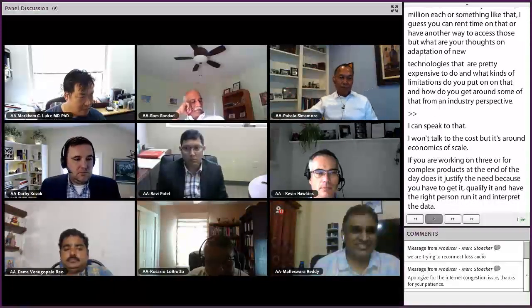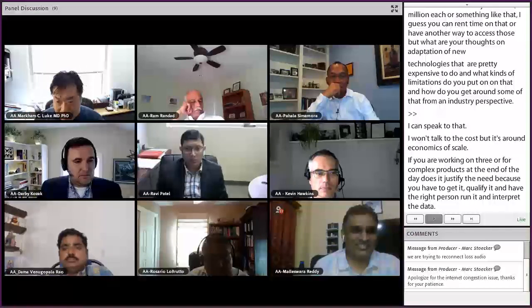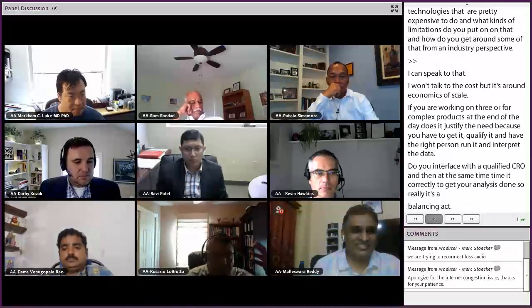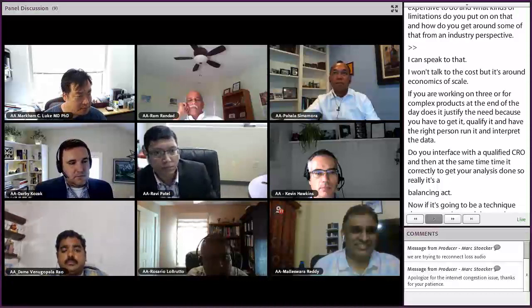Now, if it's a technique that you're going to be using time and time again, for characterization as well as potentially for release and stability, I'll give one example, like size exclusion chromatography, where you might be doing SEC-UV-MALS for characterization, but then you use SEC-UV for release and stability. That might be something which makes sense to bring in-house.